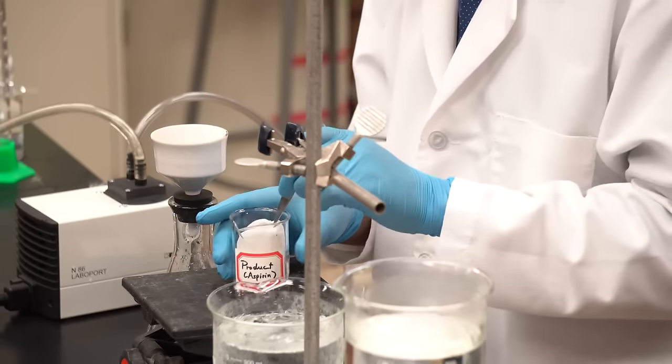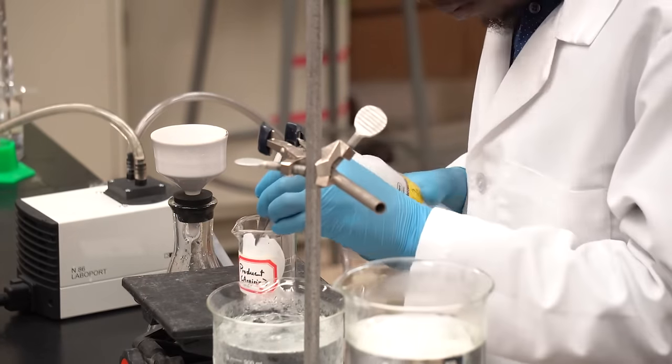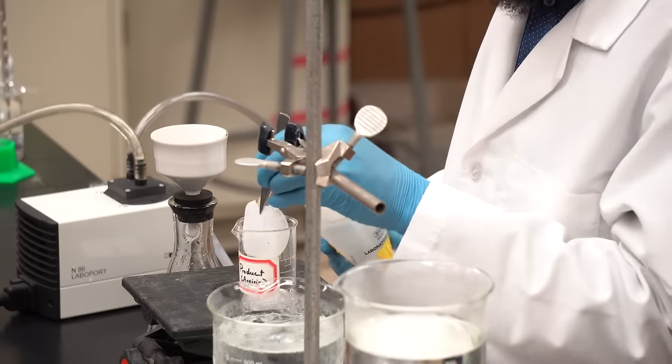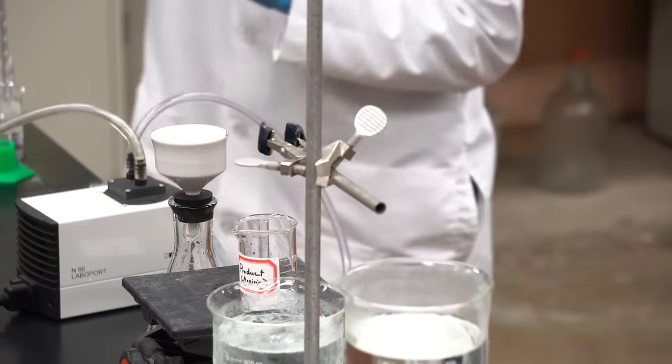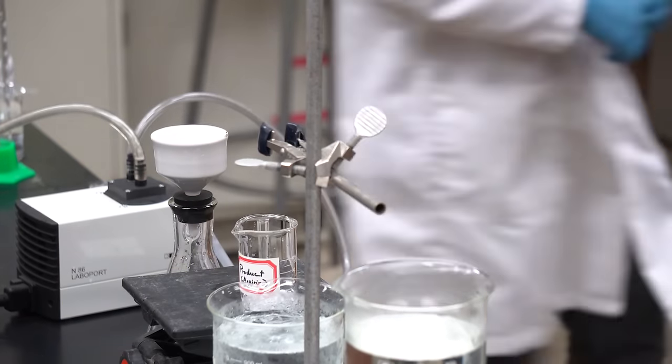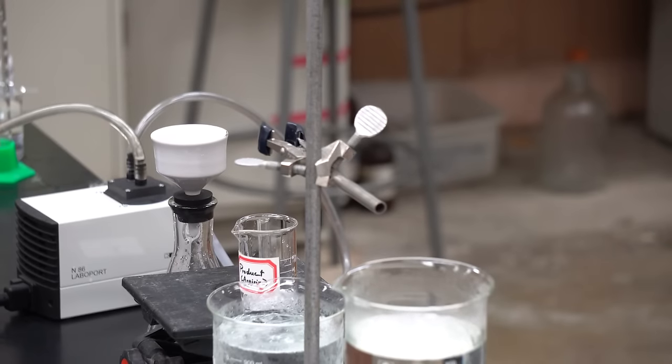Let's then collect our product in another vessel. We'll make sure to save all our product by rinsing the filter paper with ethanol into our beaker. Even though we've collected our product, it is not totally pure. This is because it still has trace amounts of the starting materials. We'll have to perform recrystallization to purify our product.